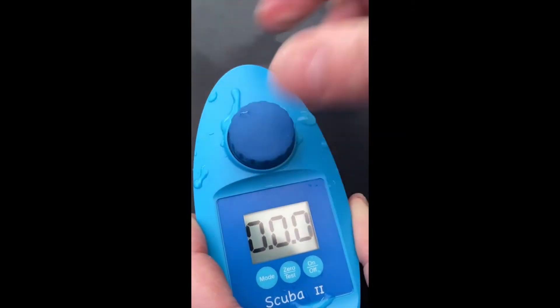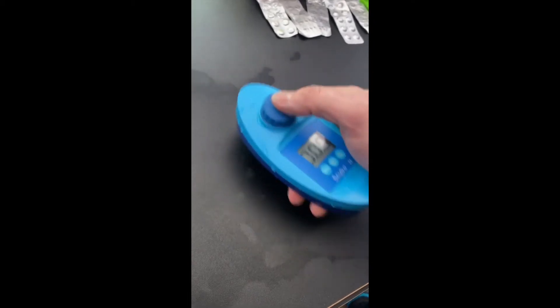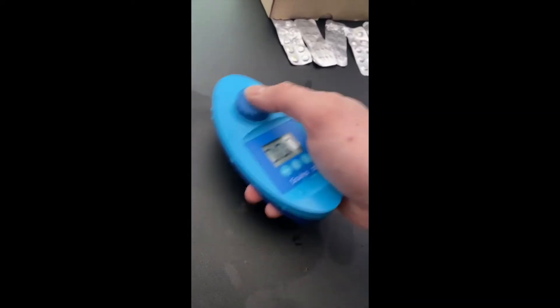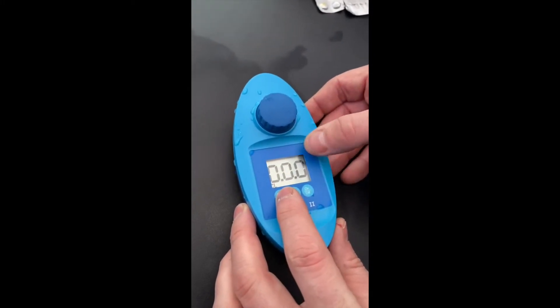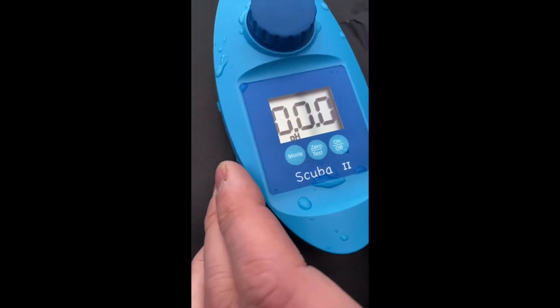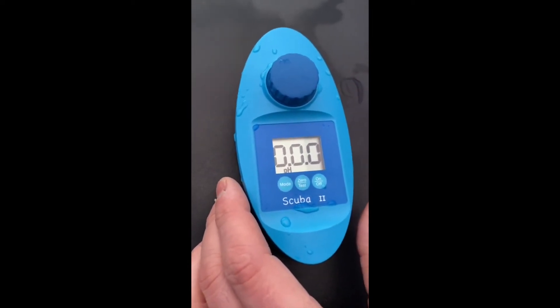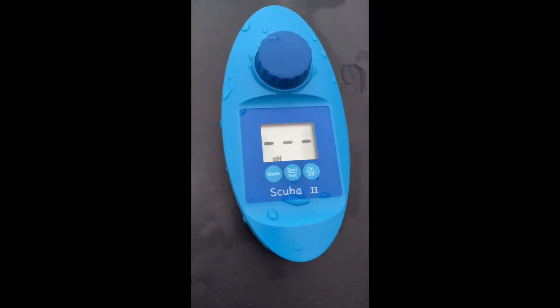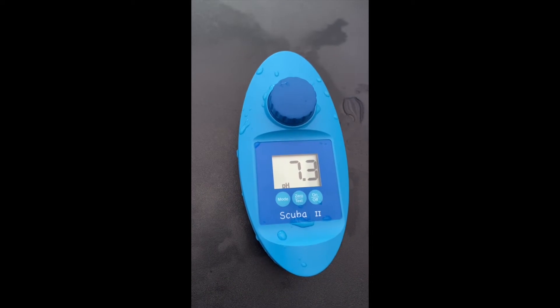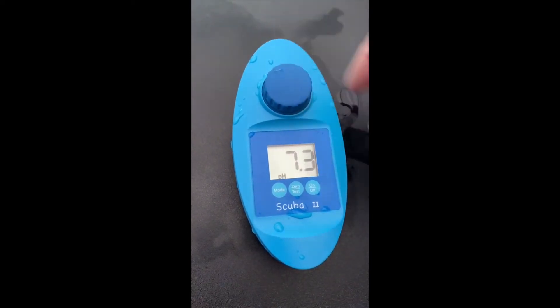Now we can put the lid back on, and the first thing we need to do is give it a little swirl for 15 seconds. Then we change the mode — this one we're testing is pH, so we put it on pH. We leave it for another 15 seconds, so we've only got another five seconds for it to sit. Then we press test and now it's going to test. We can see the pH level is 7.3, which we're happy with.